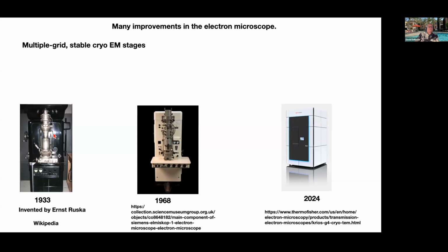Here's the original microscope built by Ernst Ruska in 1933. Here's the sort of microscope that John Finch used to produce our images that Aaron and I and John used. And here's, of course, the cryo-EM. The price has gone up quite significantly.